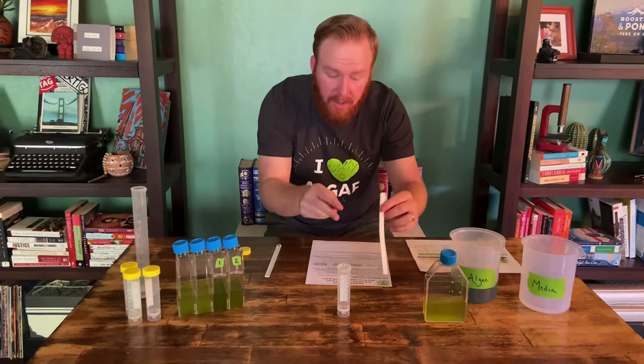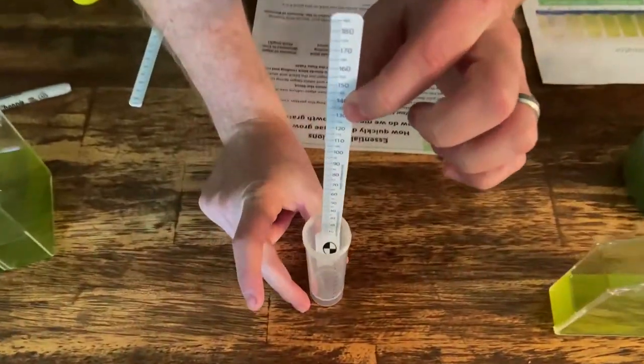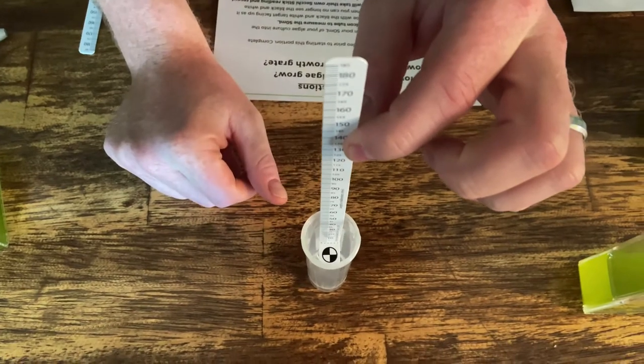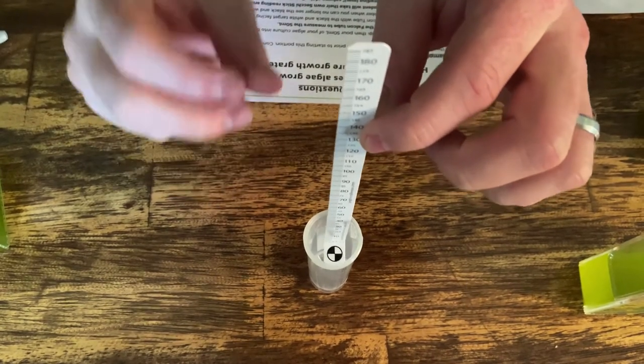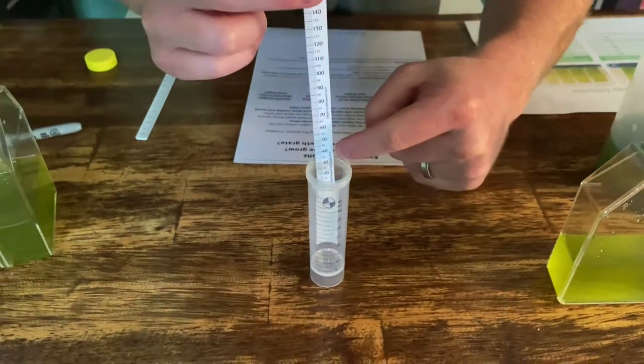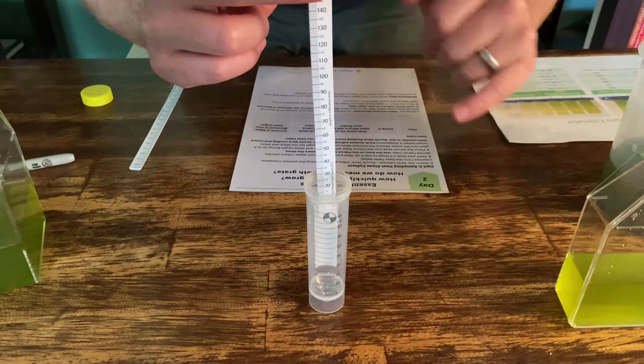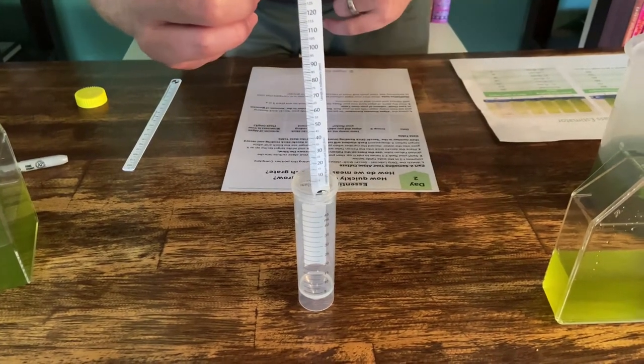Then we will take our SecchiStick and lower it into the skirted falcon tube, keeping an eye on that shield until it disappears. When the shield disappears, we'll hold it steady, and wherever the water is touching the ruler — the water surface — we'll mark that value down in millimeters. That's what we're going to use to estimate biomass.